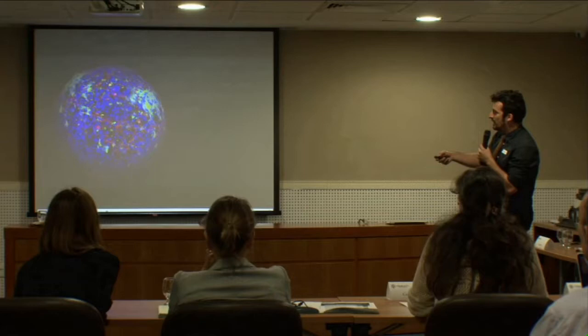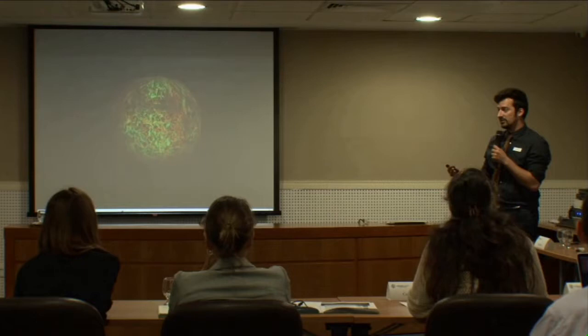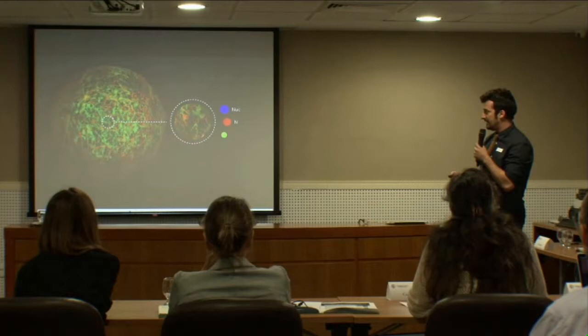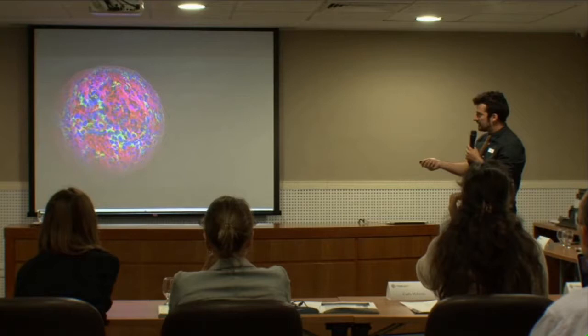We were really focusing on astroglia too. We didn't want to have only a neuronal population, because for toxicology it's really important to have the supportive cells, astrocytes or oligodendrocytes, that will add to the toxicology effects. We also found a really high myelination of the axons. I'm going to show a little bit more later. We did O1 for oligodendrocytes, and we can see how the oligodendrocytes are grouped over the aggregate.